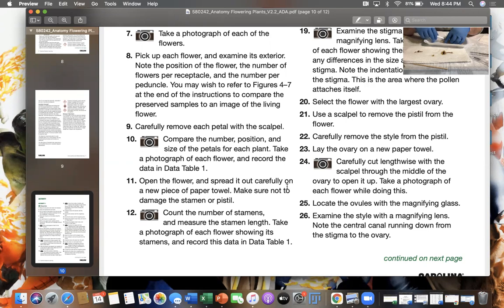I feel like an easier assignment probably would have been just like go buy a fresh lily at like anywhere. So I'm just going to use the wooden stick to try to tease out the stamens here.